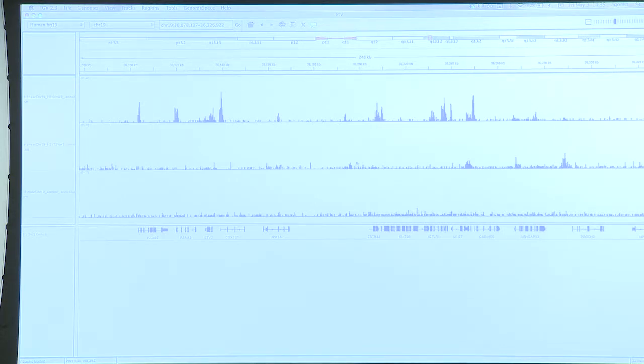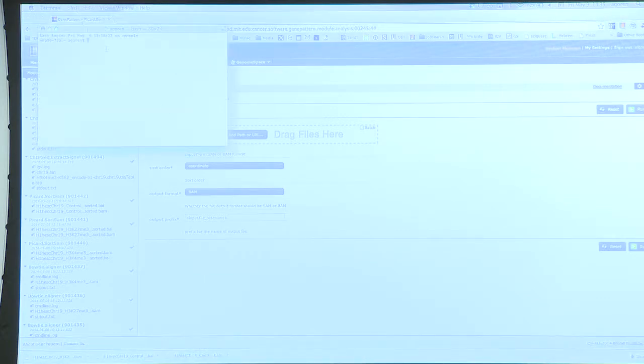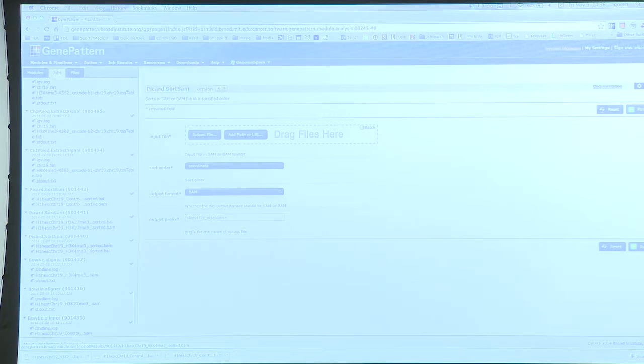I think this is actually something that for me was really exciting to see, if you look at the reads at the beginning, which I'll show you in a second, starting from reads and then really visualizing them. So what I want to do is show you how I made them into TDFs. For instance, I'll do it for one, but in general it's the same.